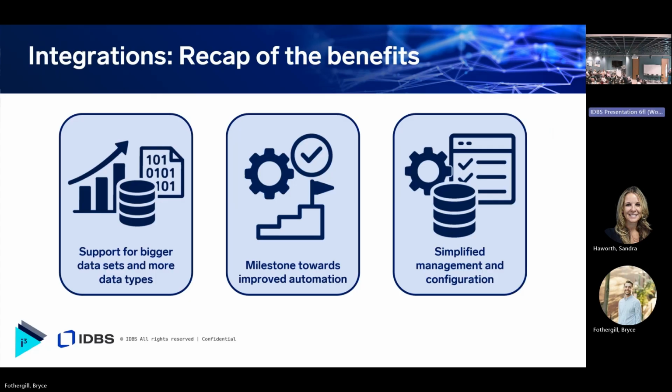So the end goal of labs is to have that end-to-end automation. And with integrations, this allows you to not have to do things like manual entry in the spreadsheet. So that's a faster end-to-end system. And finally, integrations allow for simplified management and configuration. So without integrations, you might have data in several places, but with integrations, you have this end-to-end system, and data management becomes much easier to work with.